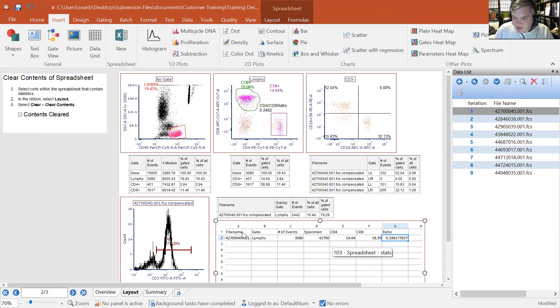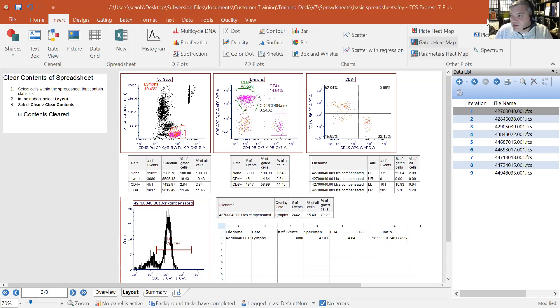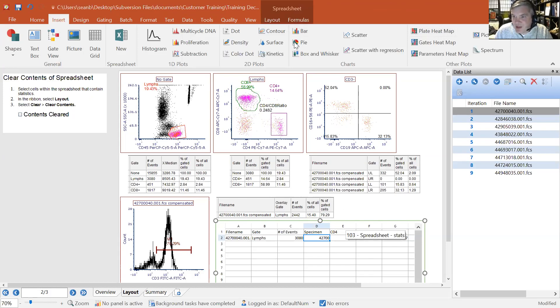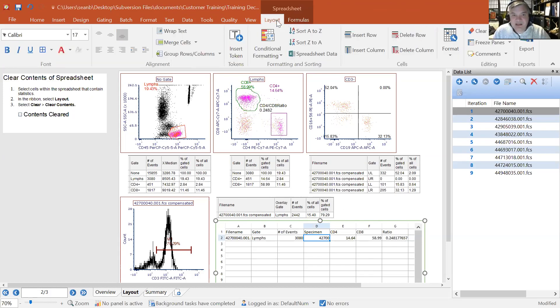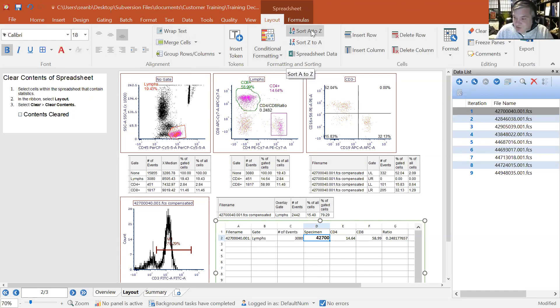When you click on a spreadsheet, you see the Spreadsheets tab. In the Layout tab, you have all the options Excel has: changing formatting, centering, aligning, merging cells, wrapping text, sorting data, and conditional formatting. The sorting function is particularly useful for flow data — imagine a 96-well plate where you drag and drop 96 data files and sort by MFI to find which well has the highest expression.